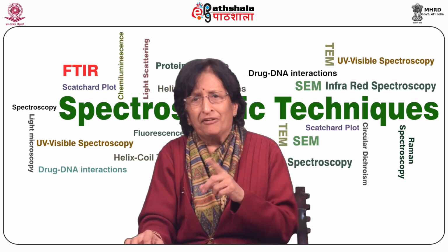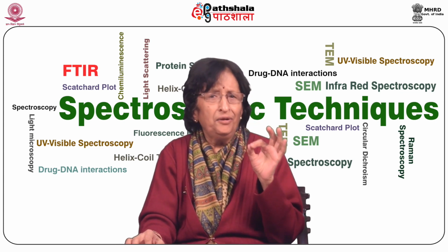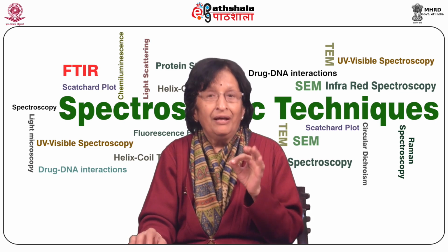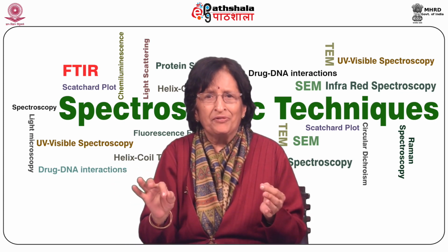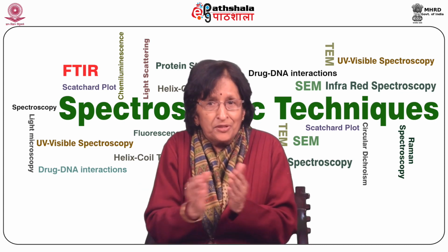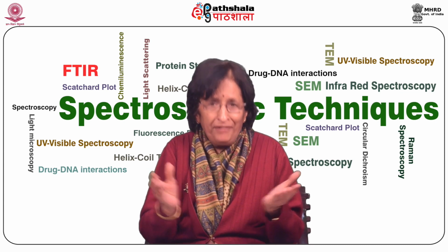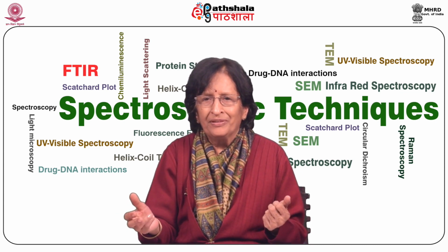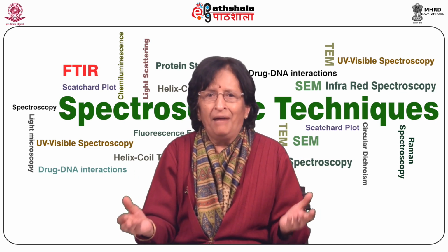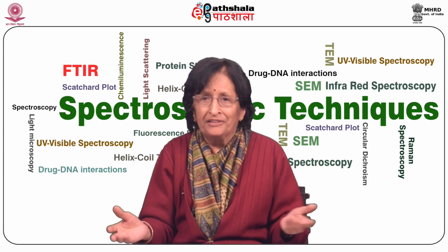The Beer-Lambert law is valid only at low concentration. At high concentration, the average distance between the absorbing molecules becomes small. The charge distribution is affected by the proximity of the neighboring molecules. It alters the ability of the molecules to absorb a given wavelength, and then it's not correct.